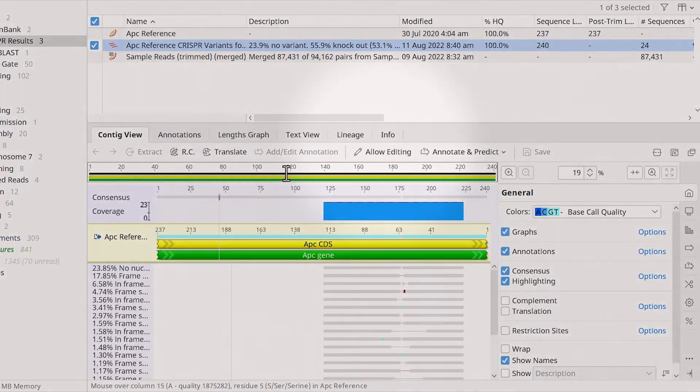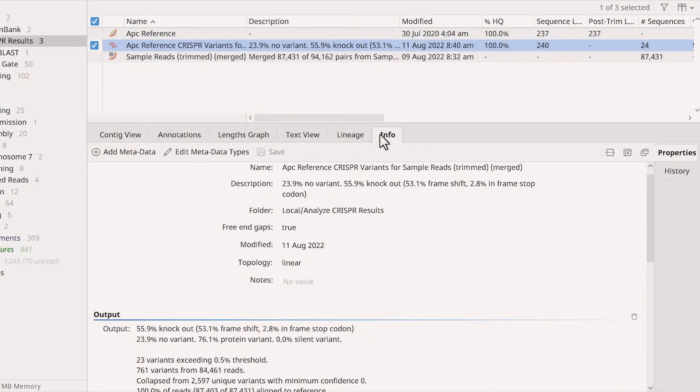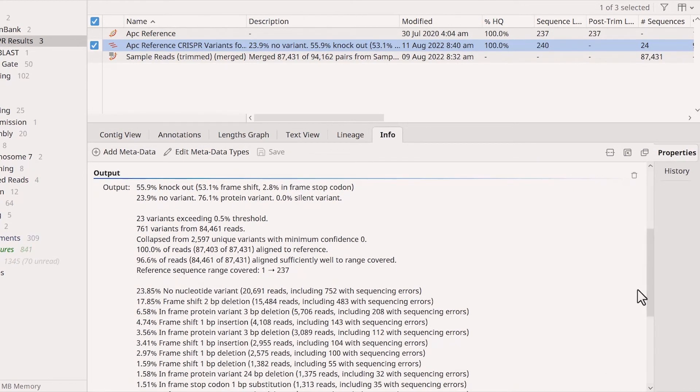By switching to the Info tab, you can see the overall results for the output, including the percentage of reads with no variant versus the percentage of reads with knockout variants.